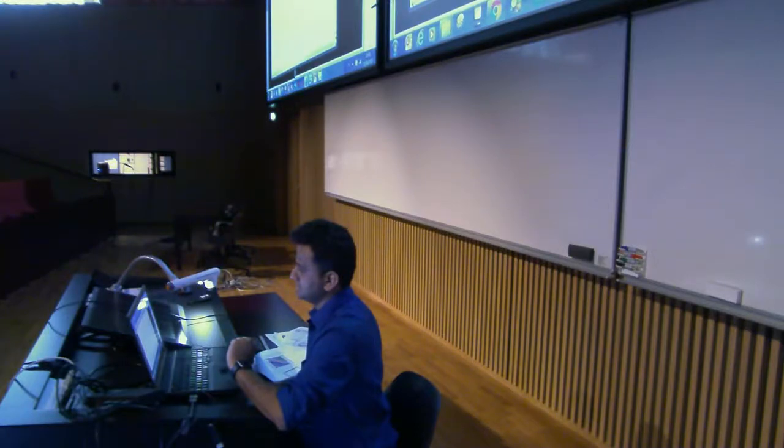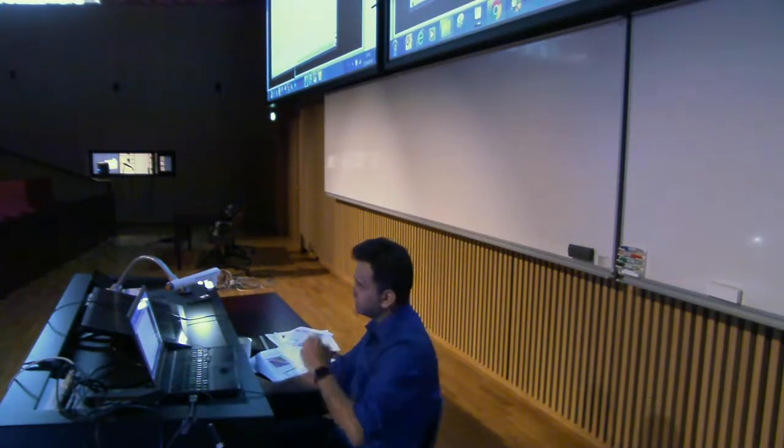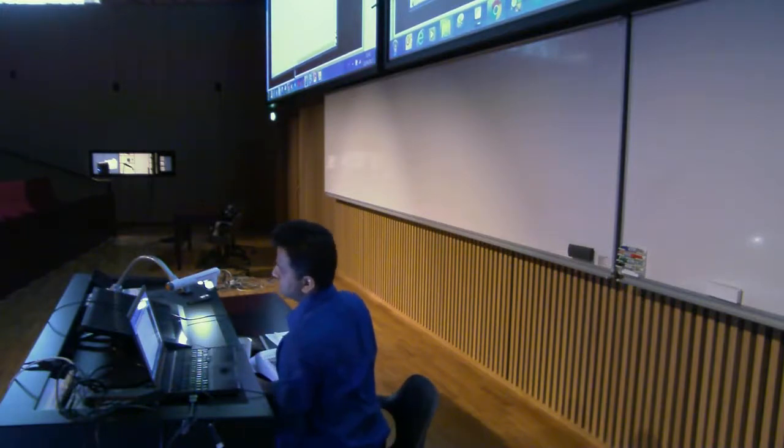So the result says, percentage of co-localization threshold, okay, where is my estimate? R-coloc, okay, so 0.5. That's the correlation coefficient, Pearson's correlation coefficient. It's 0.5, and 0.5 is not good, because 0.5 squared is even less, so that's not a good co-localization, I would say.